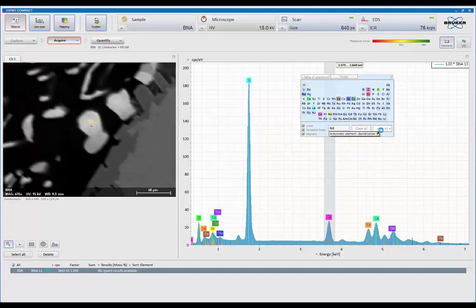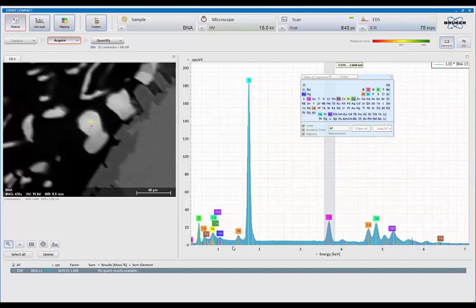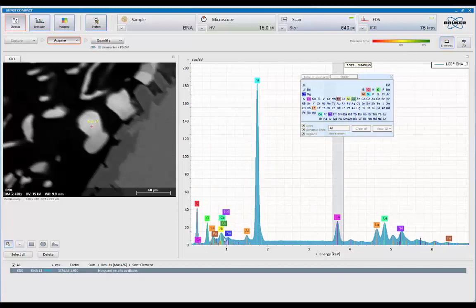In Auto ID, there's complete background subtraction. It checks for the relative intensities with an aligned series. And so it's looking for overlaps. So it's found a rare earth overlap over here. And it's identified all my other peaks in this area. And overall, that looks rather nice.